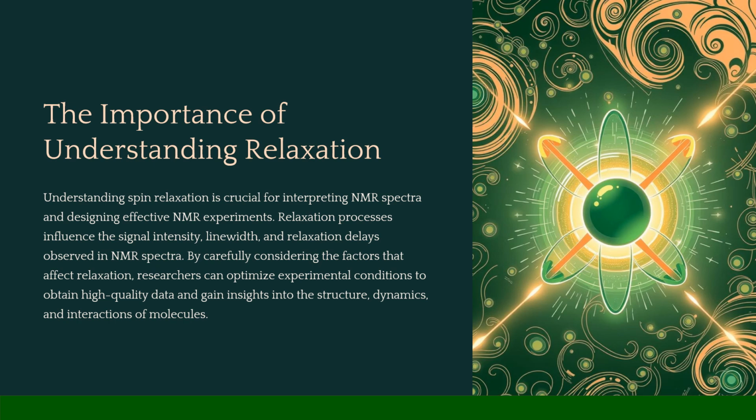By understanding how relaxation works and what factors affect it, researchers can make more informed decisions when setting up their experiments. For example, they can adjust experimental conditions to optimize the quality of the data they collect. This can include improving signal resolution, enhancing contrast, or reducing noise.